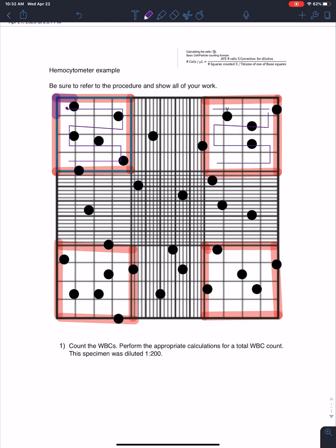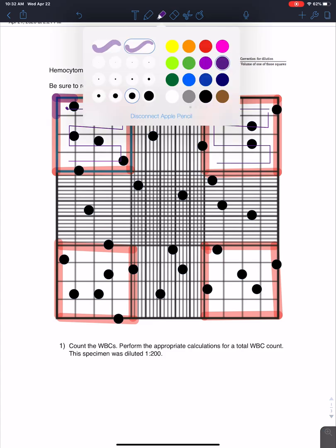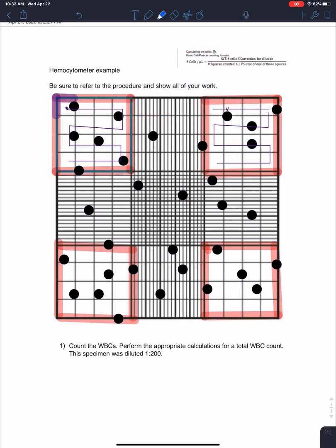So let's count these cells. So let's go back here. I'll put my highlighter on. We'll make it another color so we can see. And we're going to count, whoops, I'm sorry. We'll go ahead and count this one as 1. It pretty much is in this box. Okay, so we'll count it 1. And we're going to go across here. Now we don't count this cell in this box. Okay, now when we go down to this box, it's on the top and the left, so now we're going to count it as 2.